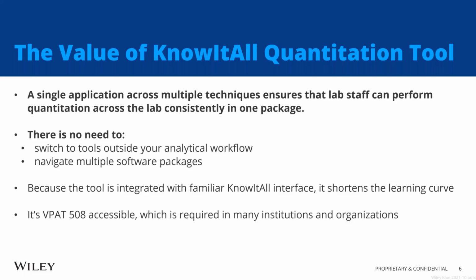If you're performing quantitation in Microsoft Excel, it's a manual process that's prone to error. It's prone to not being able to identify who was doing what and what was done to the files. But with our new quantitation tool, there is no need to navigate multiple software packages because the entire workflow can be done in KnowItAll. So because it's integrated with the familiar KnowItAll interface, it shortens the learning curve and reduces the amount of training that lab personnel need.